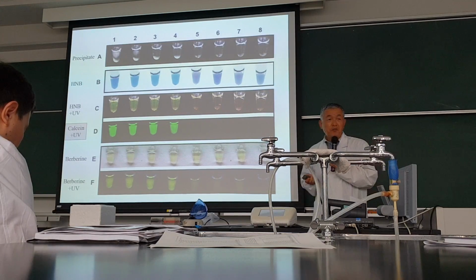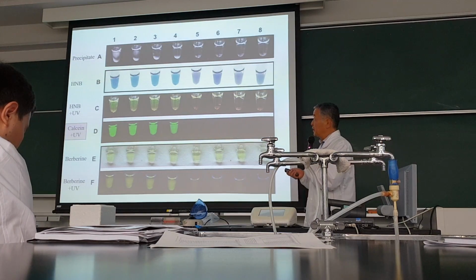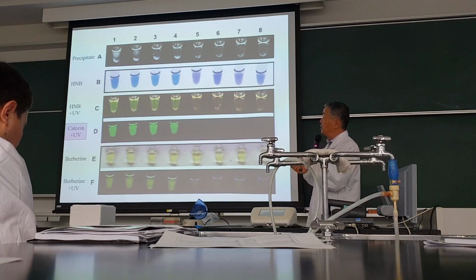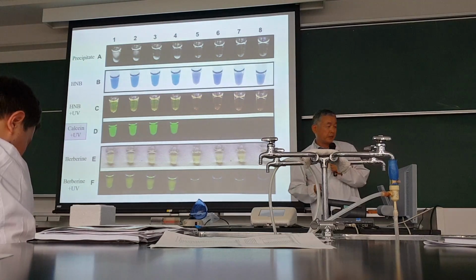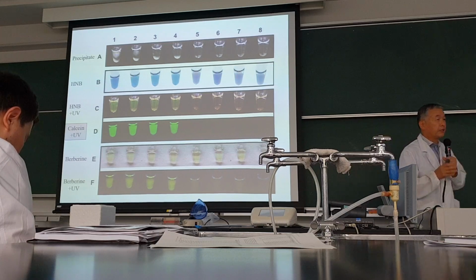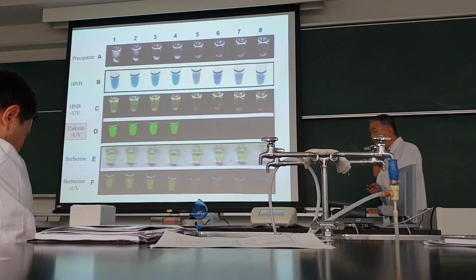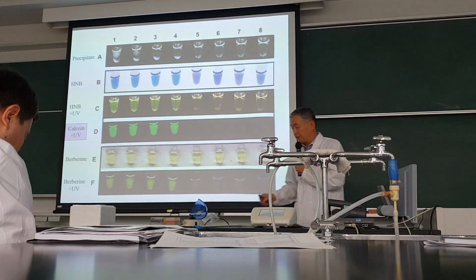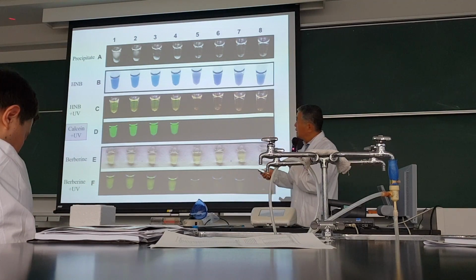There are some systems for detection of gene amplification, using a precipitation product that can be produced. Some sensor can detect the precipitate, which means the amplification of the genes.